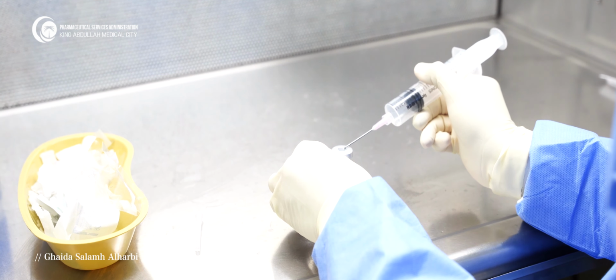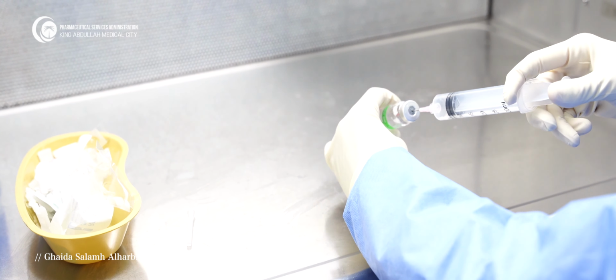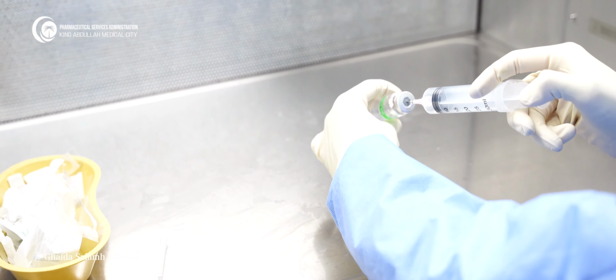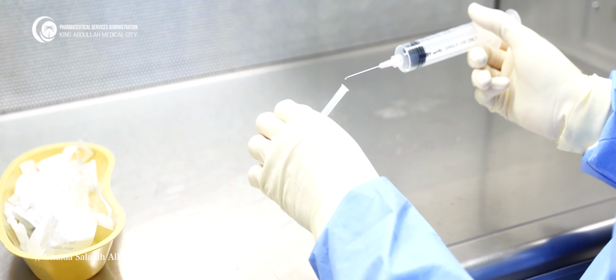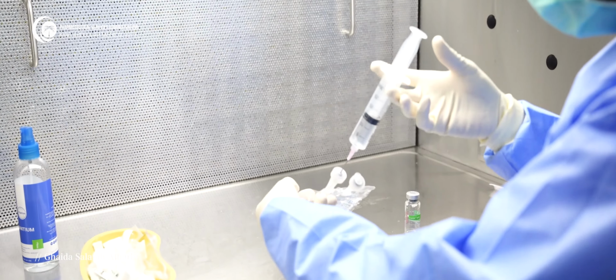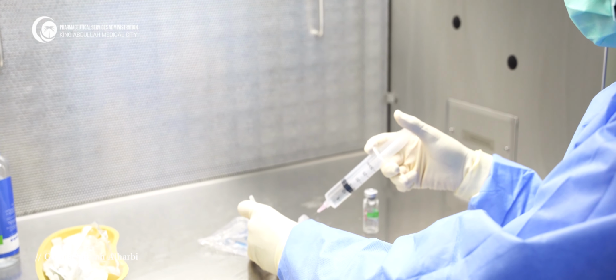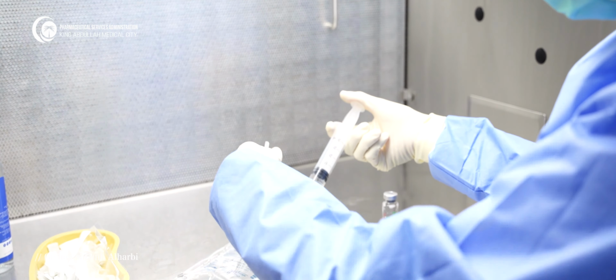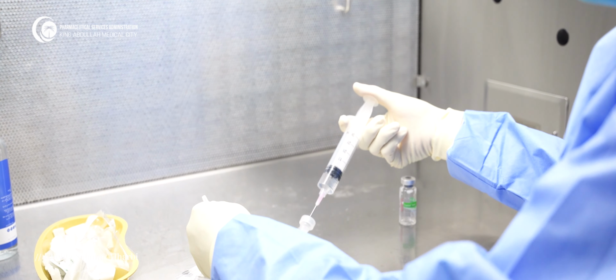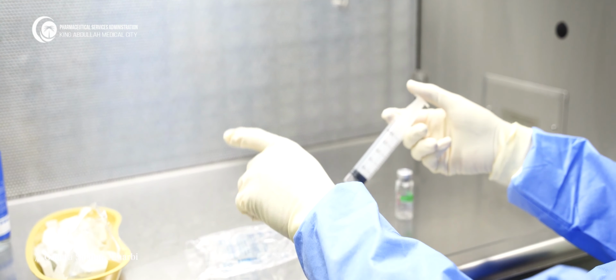One of the wrong practices that shall be avoided if I withdraw or reconstitute: now I'm exposing the septum away from the HEPA filter, the first air that comes from the HEPA filter. Also, I'm working in an outside part of the hood. I should work inside at least 6 inches from each side. And also, I should transfer the medication in a way that doesn't block the air coming from the HEPA filter.